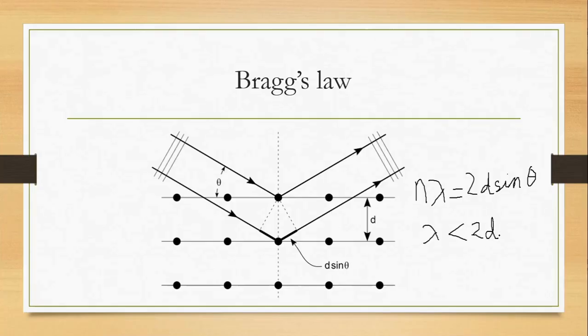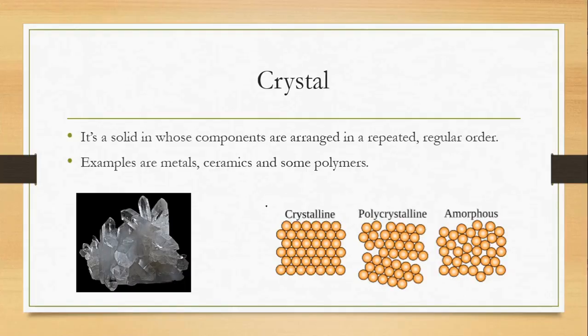So in order for diffraction to take place, in order for this equation to be satisfied, lambda has to be less than twice of d.